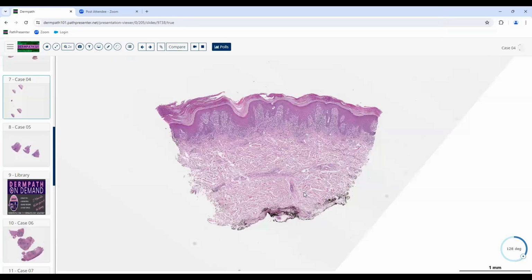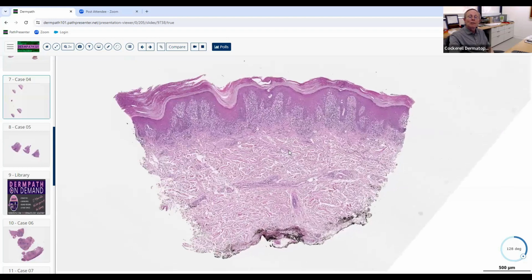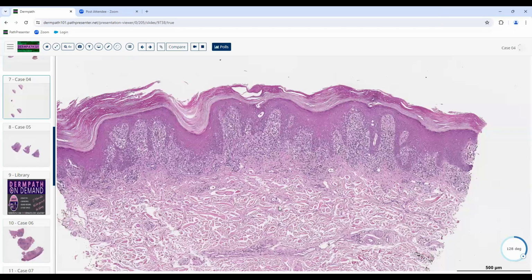Anything else? Also thought about lupus as well. Not a bad thought. Put that in there. Usually more lymphocytes, but anything else? I guess you could also consider, less likely, graft versus host, which can give you a lichenoid infiltrate. But those are also mostly lymphocytic.